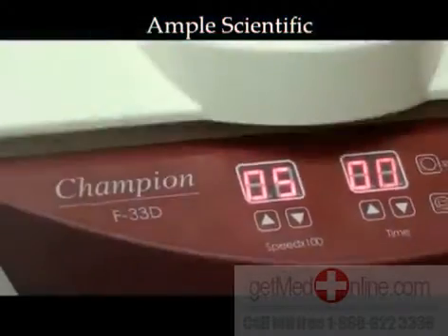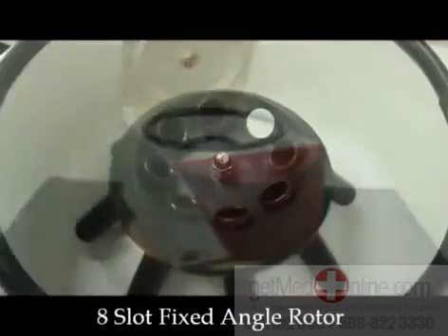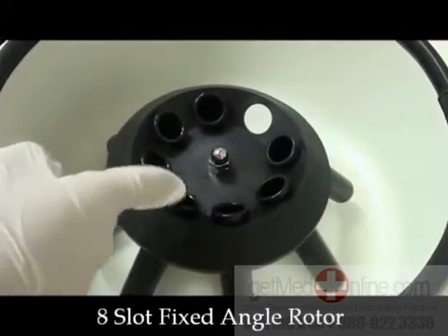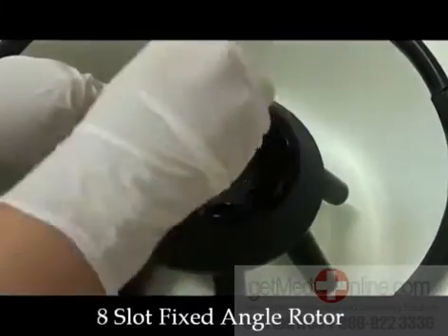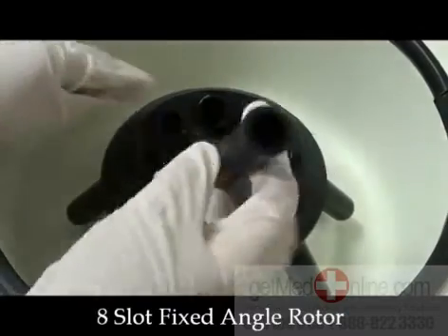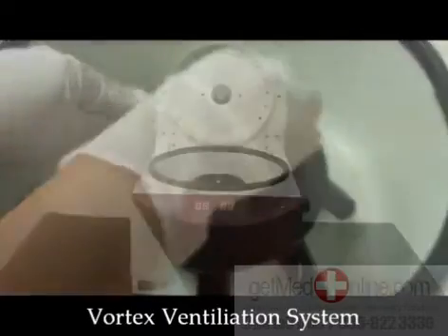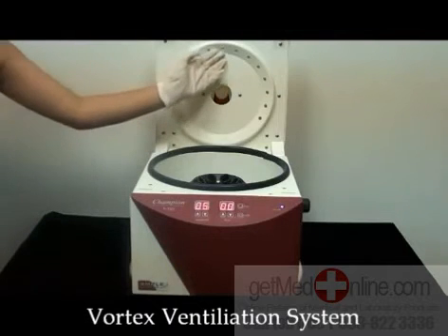Ample Scientific presents the F33D Centrifuge. The 45-degree fixed-angle rotor holds eight slots that can spin either 15 or 7 milliliters. Make sure to only use test tubes that are the proper width and length to be compatible. The vortex ventilation system keeps sample temperature consistent while maintaining sample integrity.